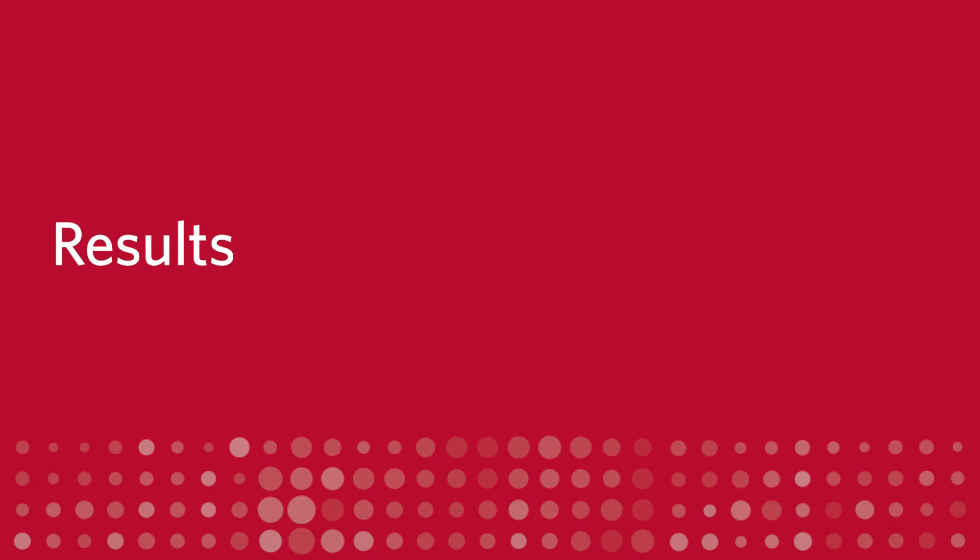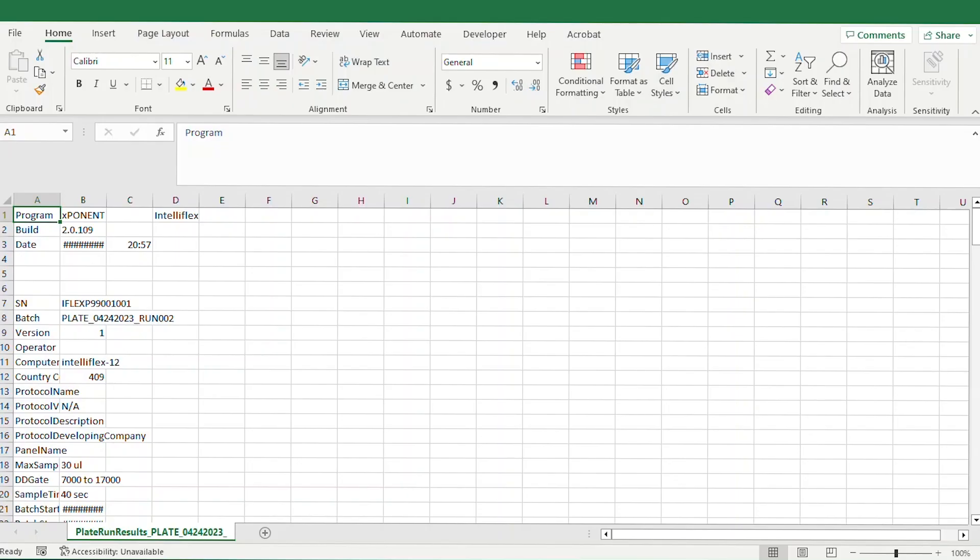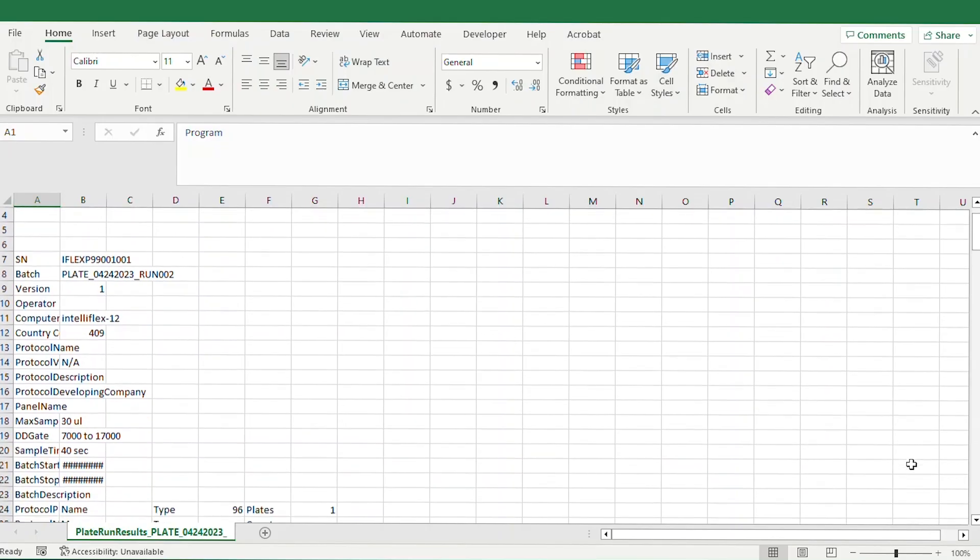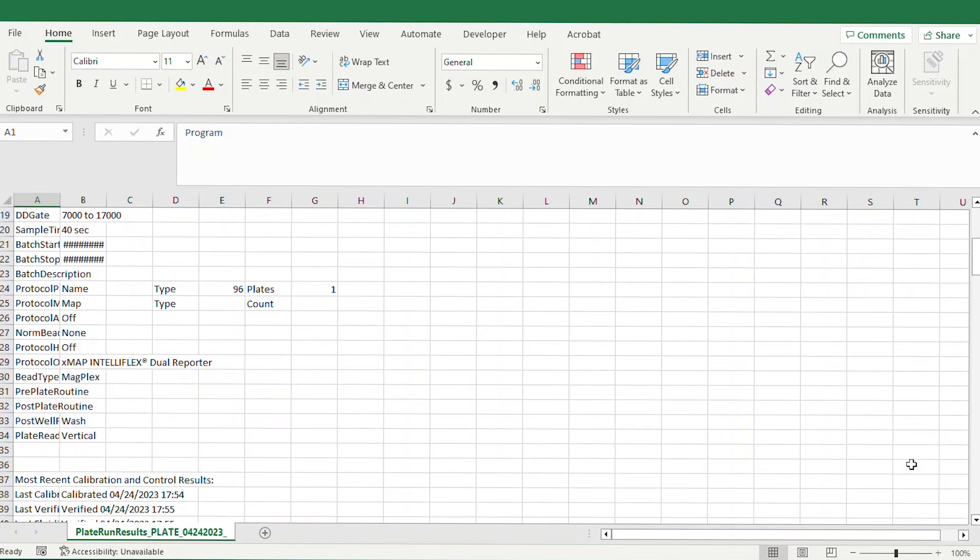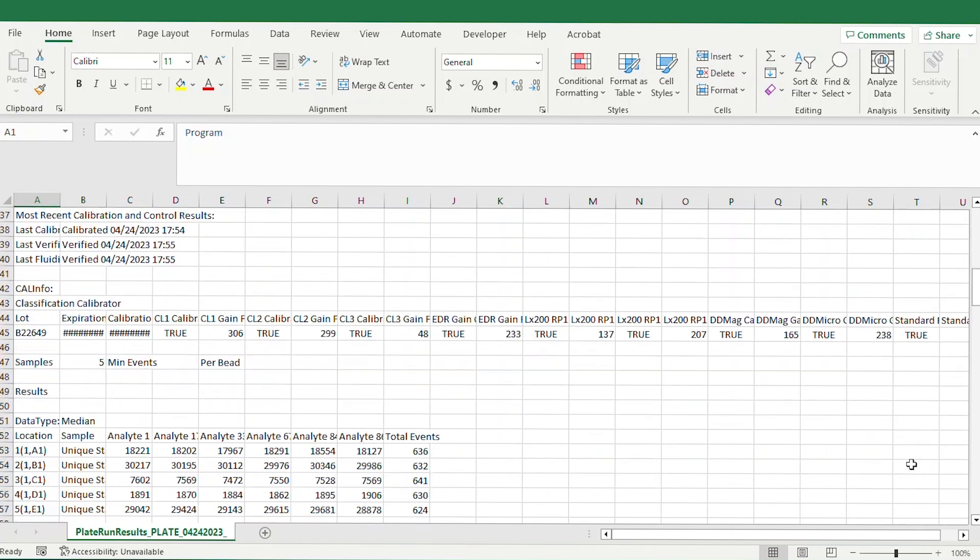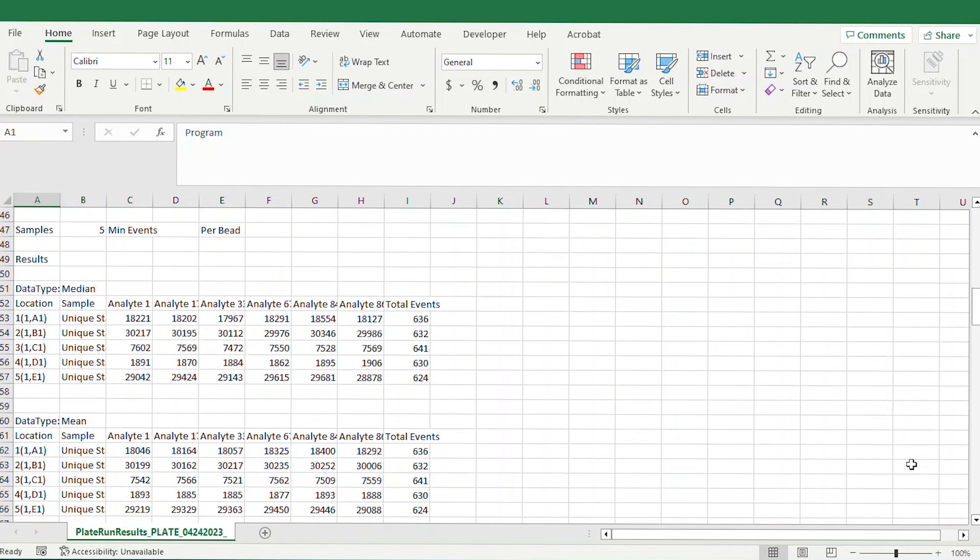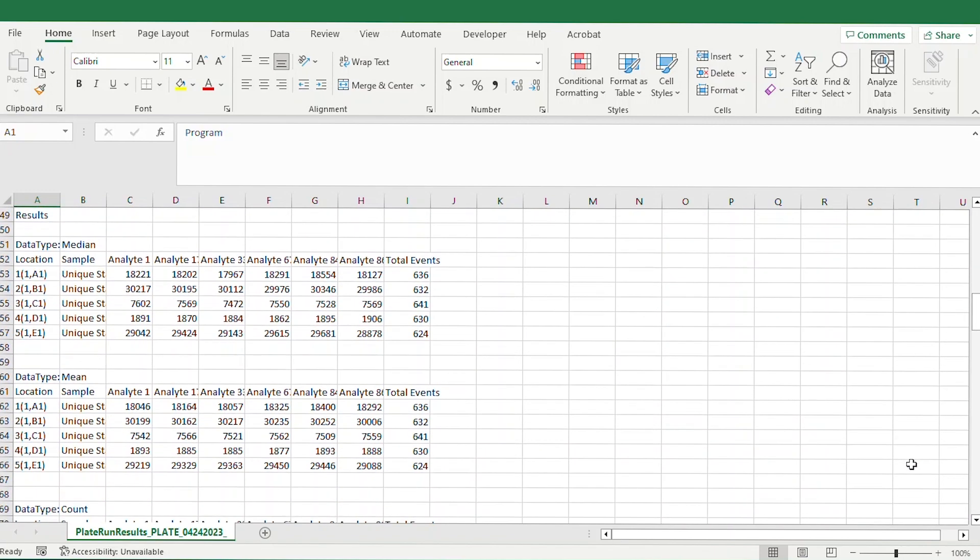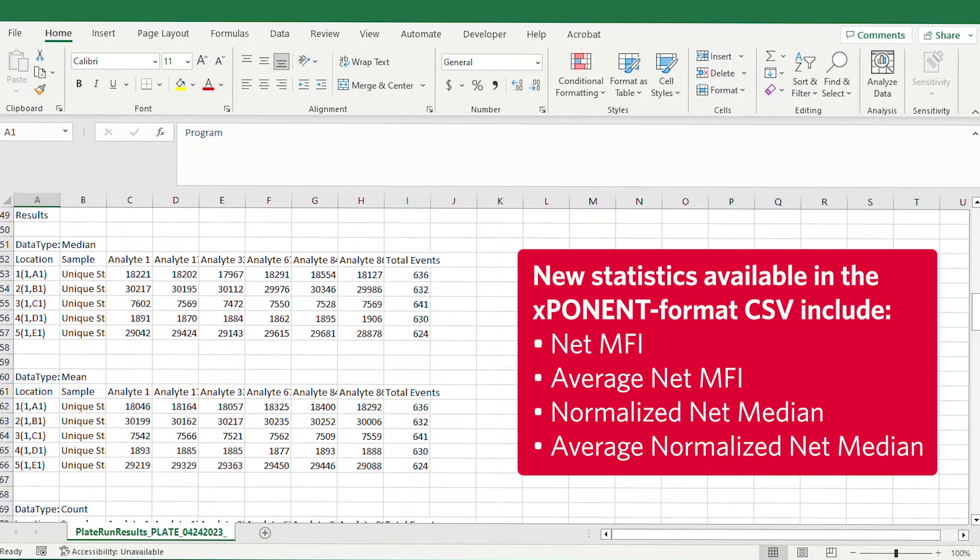Results. With Version 2.0, the exponent output file now more closely resembles the output file from legacy Xmap systems. New statistics available in the Exponent Format CSV include NetMFI, Average NetMFI, Normalized NetMedian, and Average Normalized NetMedian.